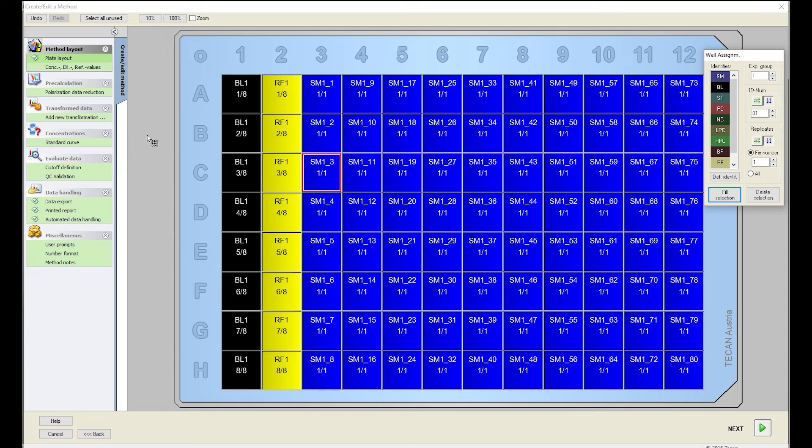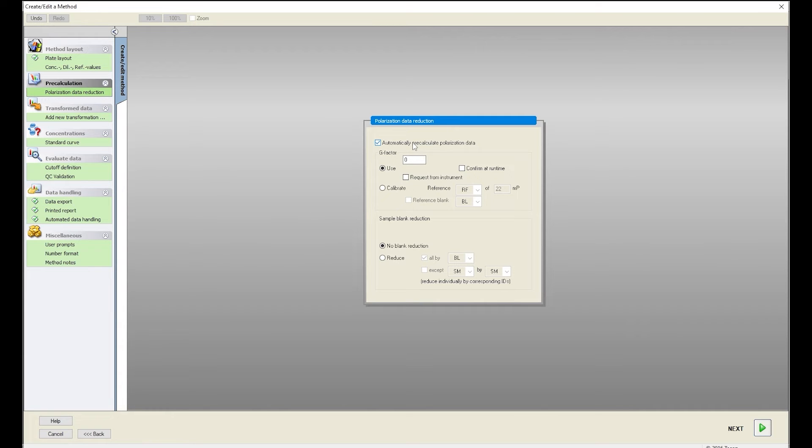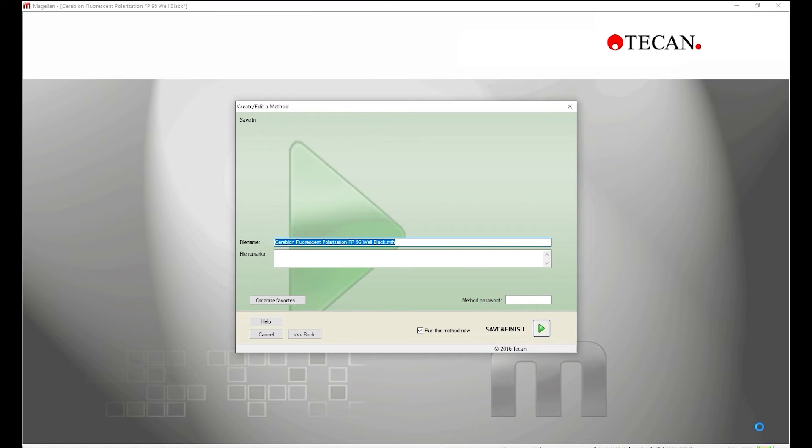Select Automatically Pre-Calculate Polarization Data. Select Calibrate. Reference is notated as RF. Set MP values to 22. Under Sample Blank Reduction, select Reduce and All by BL. Your pre-calculation setup is complete. Select Next.